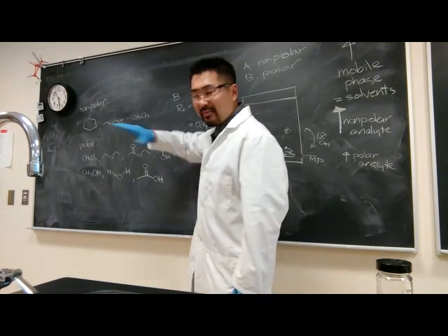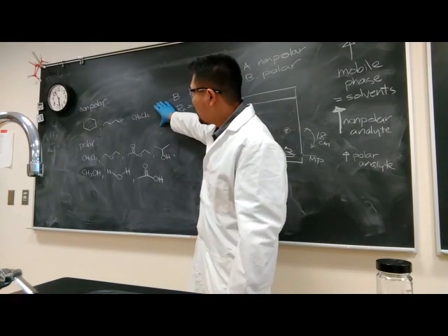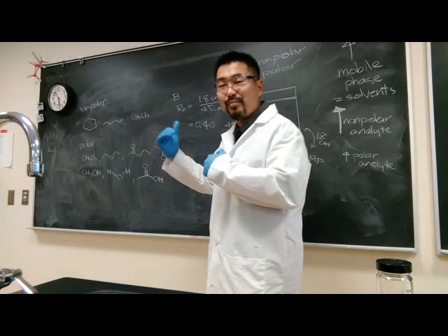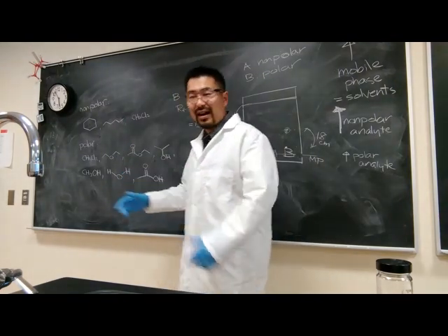And so, I'll give you some tips. Usually, it's easier to pick one solvent from the non-polar group and another solvent from the polar group that are miscible with each other. Now, you have to be careful with that because, for example, hexane and methanol will not be miscible.